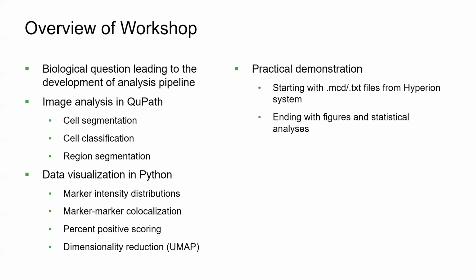Now, there will be a wide variety of imaging mass cytometry projects, let alone multiplexed imaging projects out there, and some methods of visualization might not be applicable, others might need a little bit more elaboration. So what I really want you to take away from this is the framework and the sort of modular aspect of which you can slice and dice according to your own needs.